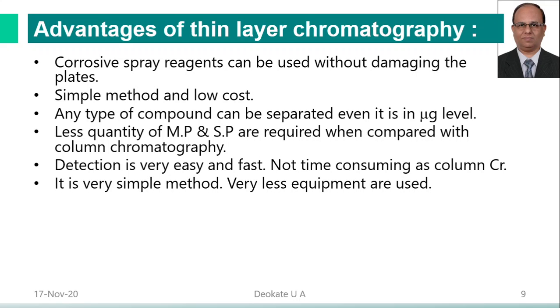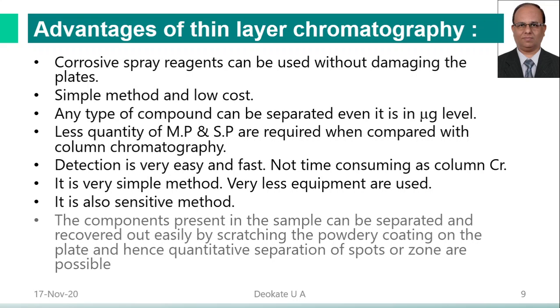It is a very simple method. Very few equipments are used for the separation purpose. It is also a sensitive method, because we know that very small samples are used. It is called a sensitive method.